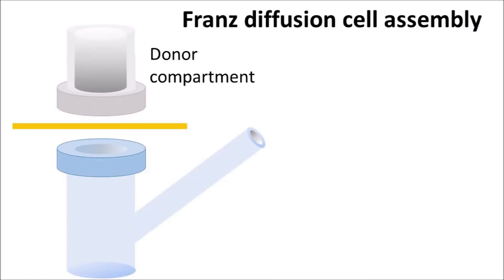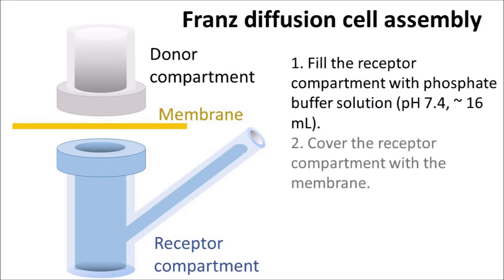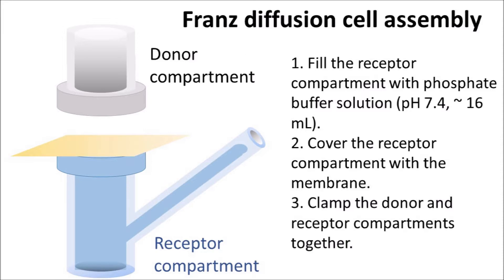That's how the FRANS cell is assembled. Basically, the donor compartment is placed on the receptor compartment and between them there's a membrane. Then we use a clamp to put the donor and receptor compartments together.